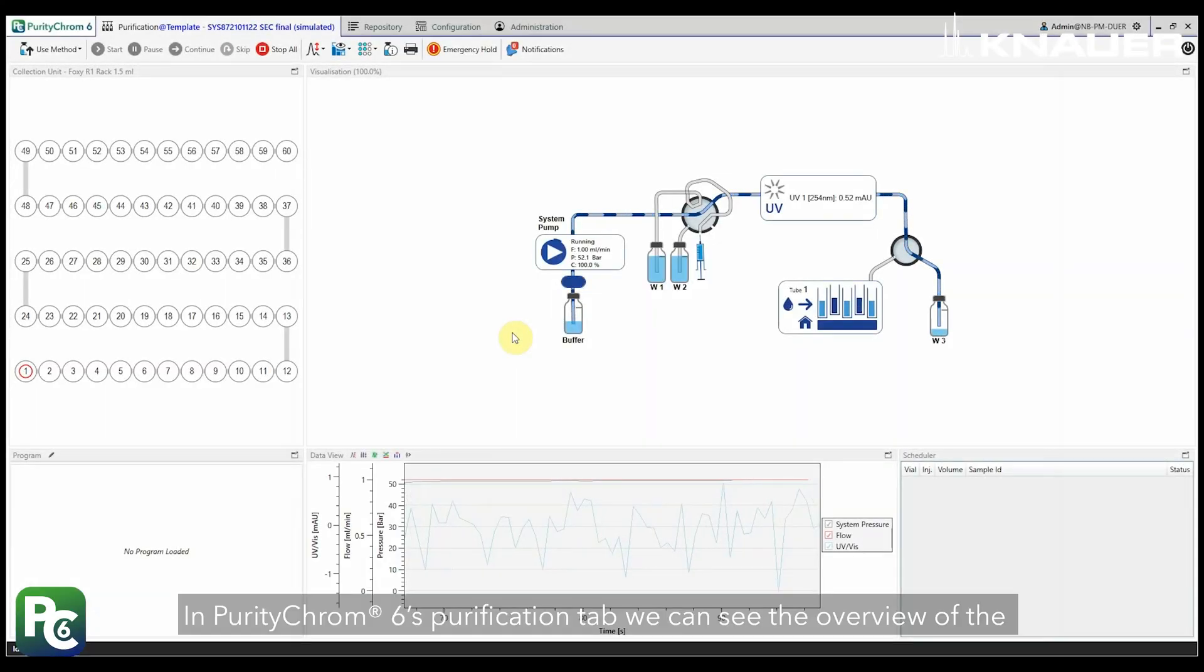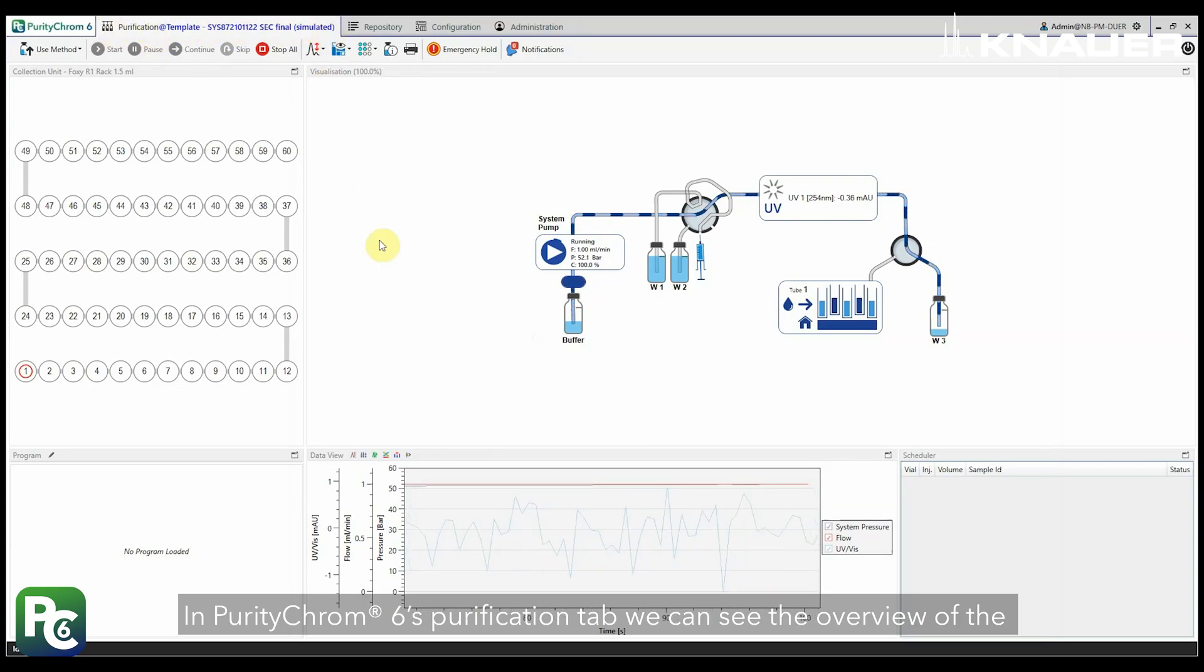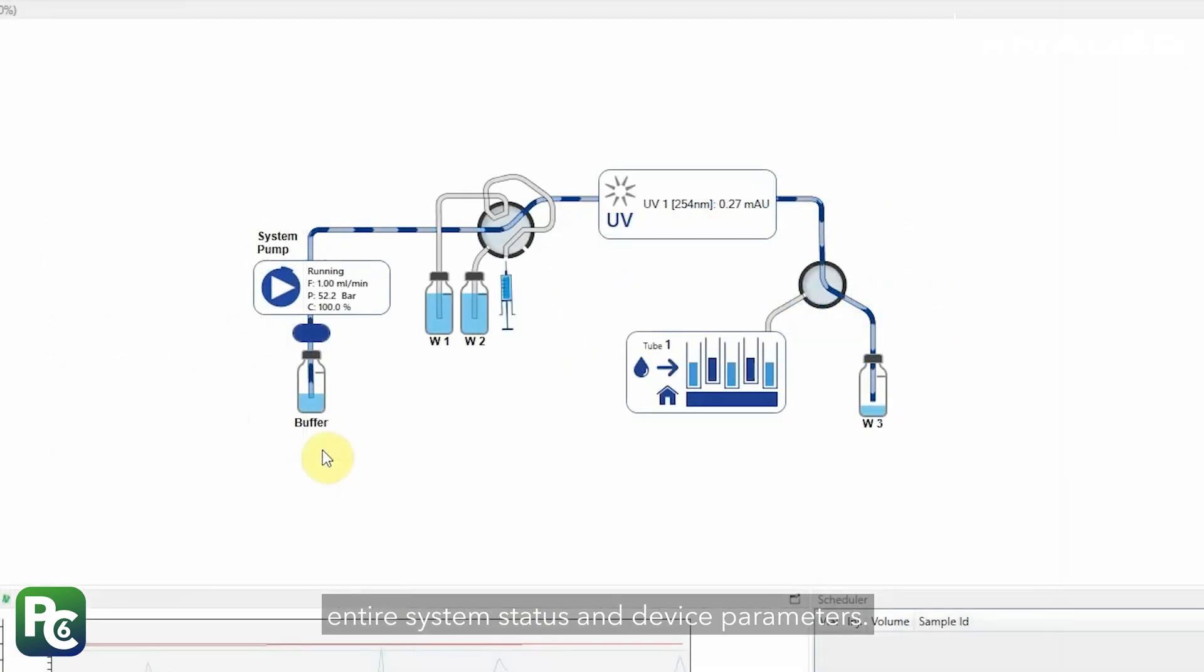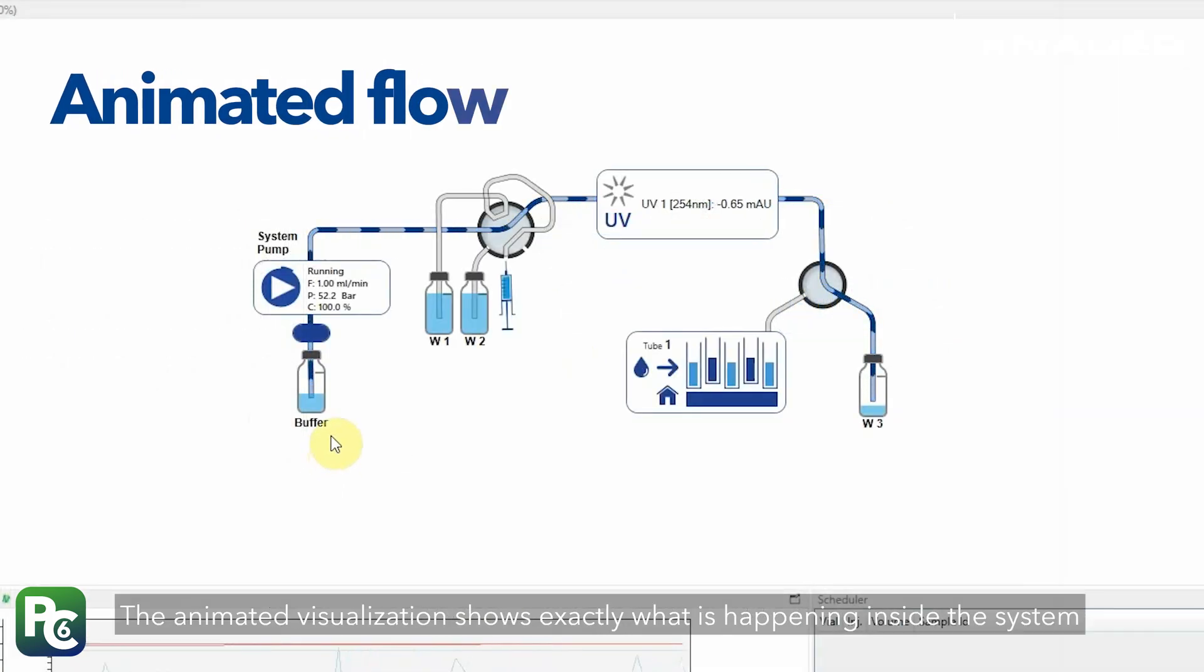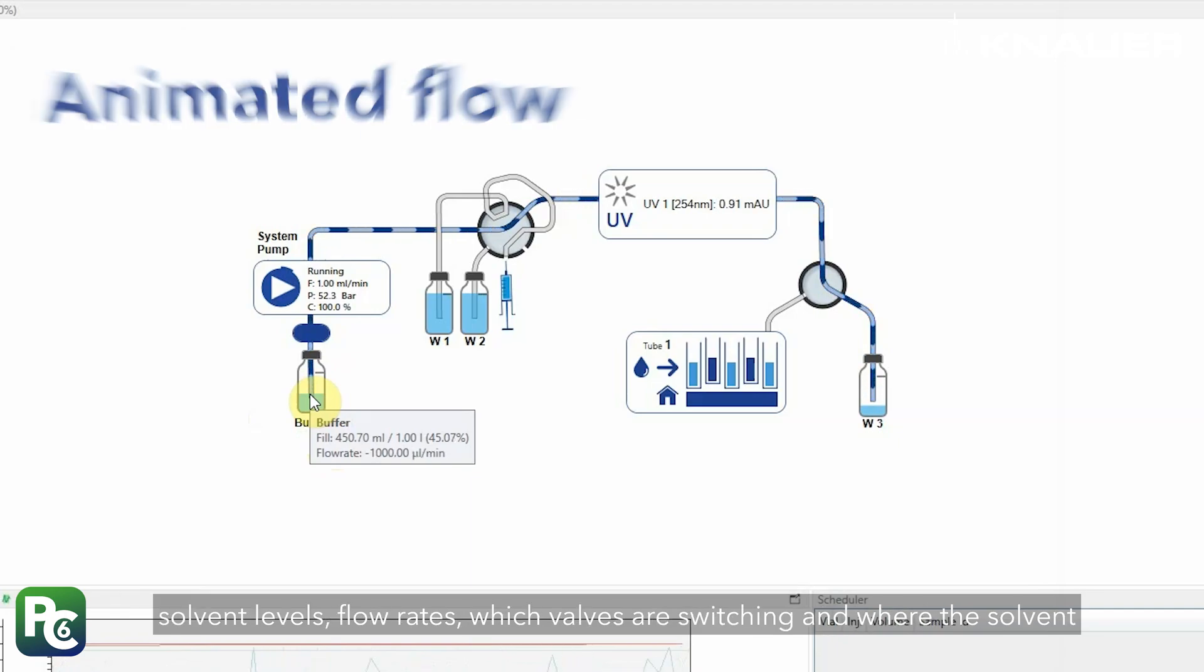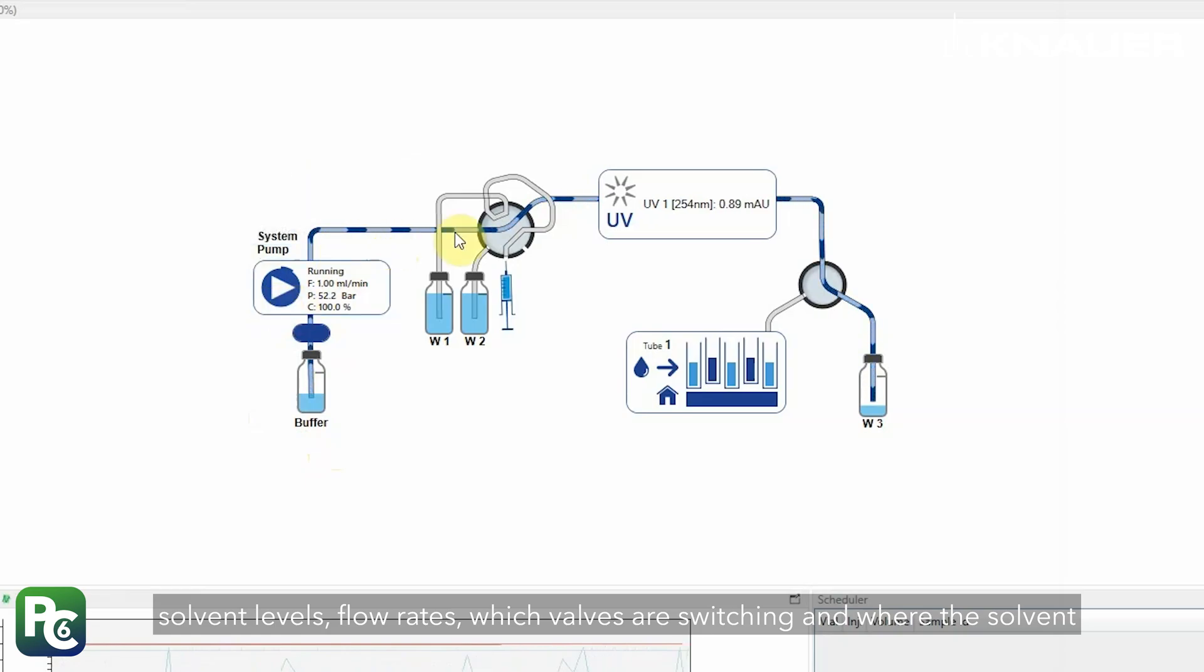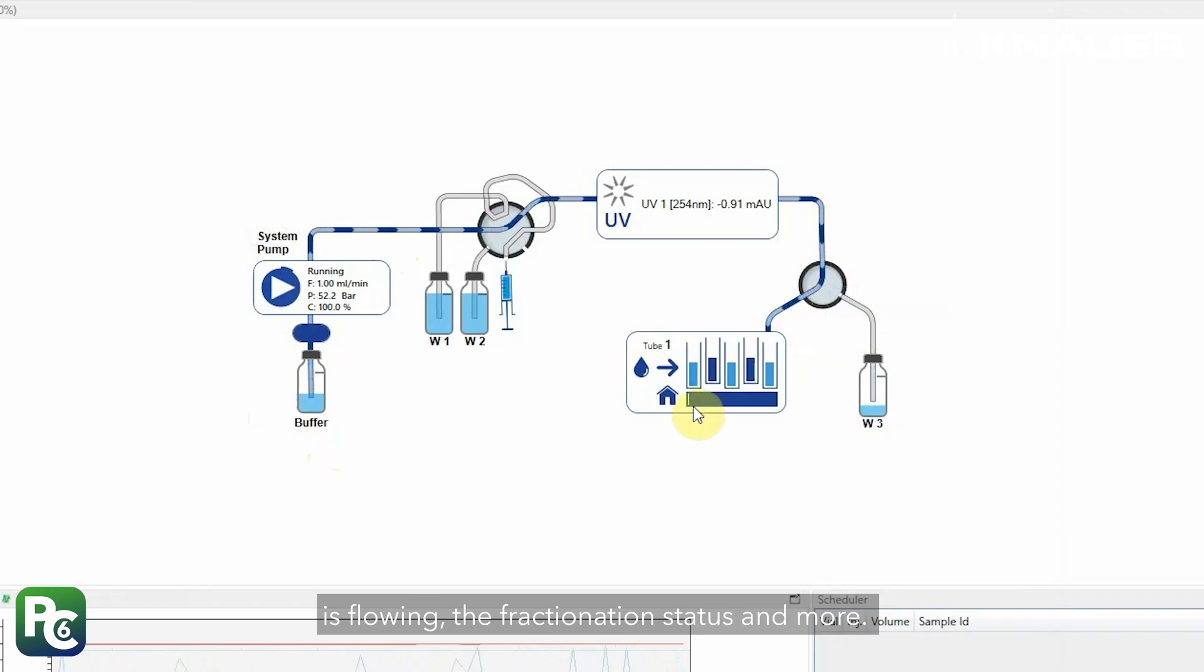In PurityChrom 6 purification tab, we can see the overview of the entire system status and device parameters. The animated visualization shows exactly what is happening inside the system. The solvent levels, flow rates, which valves are switching and where the solvent is flowing, the fractionation status and more.